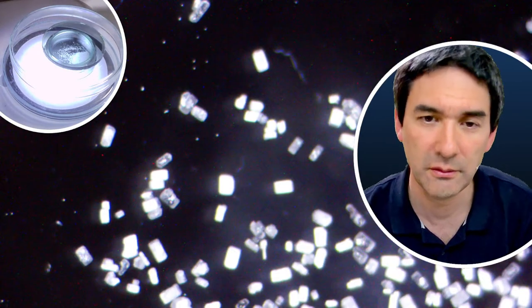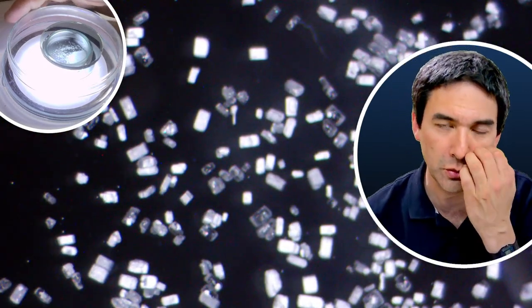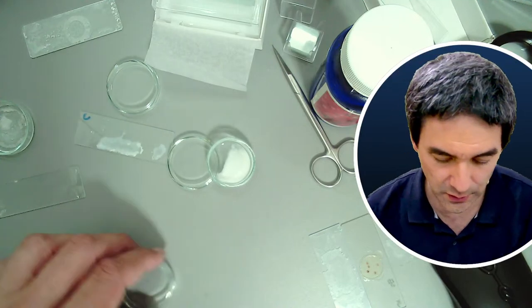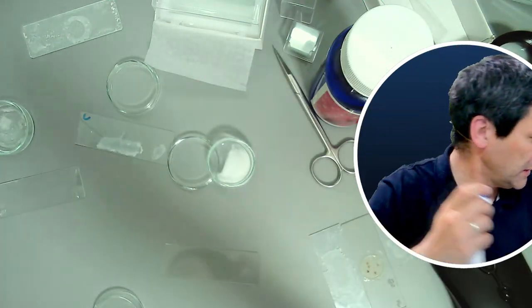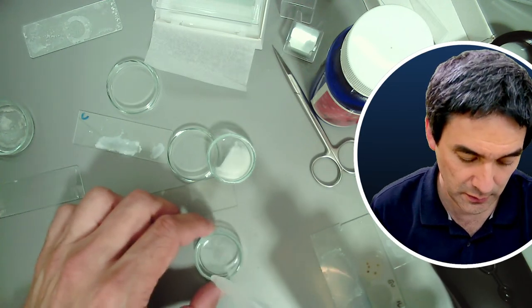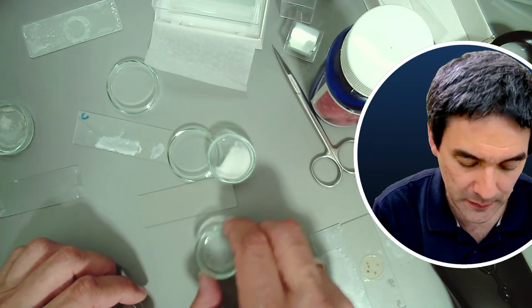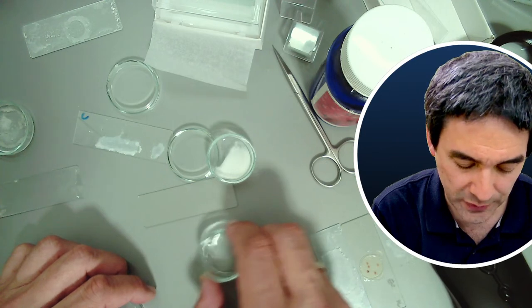So let's zoom out a little bit. You see, these are just basically little grains here, nothing special. I'd like to grow them again on a microscope slide, and I'm going to do the following. I'm going to simply dissolve them in a little bit of alcohol, and then same procedure as before. So I need a blank slide. I need a new tip, so I'm going to throw this one away. Give me a new tip, and I'm going to add again a little bit of alcohol. Where's my alcohol here? Okay, and we're going to wait again a couple of minutes to allow it to dissolve a little bit. And then let's have a look at how those aspirin crystals look.